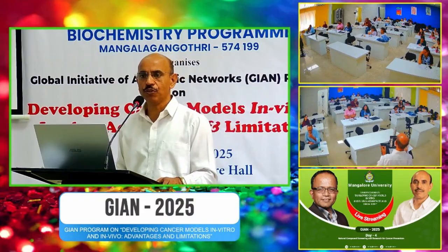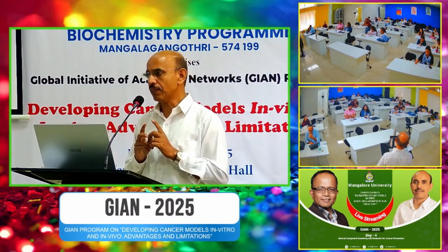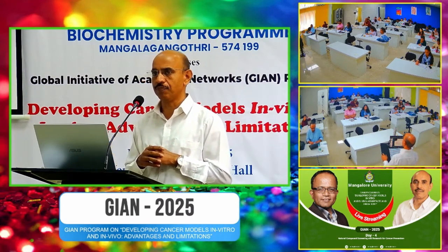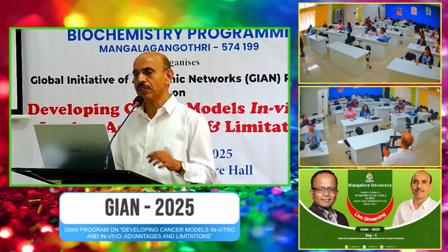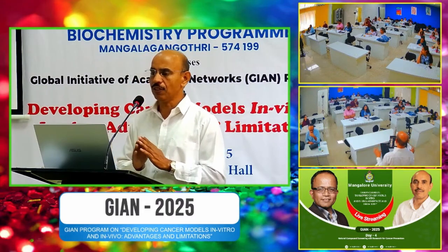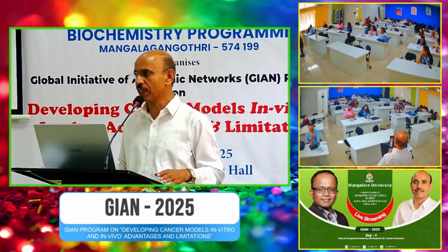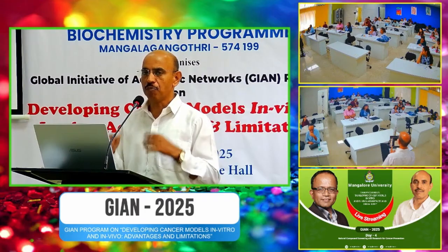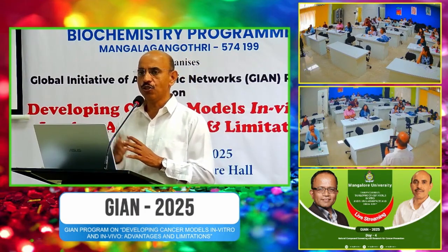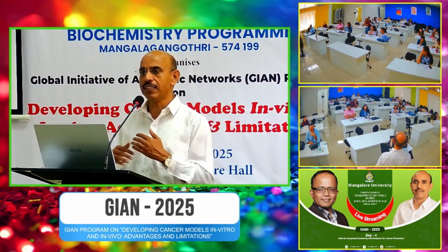you do UV sterilization of that area, because that is the best way you can avoid most of the contaminations. Even the biosafety cabinets come with UV sterilization. The best way is that you swab the biosafety cabinet before work and after the work. Before work you switch on the UV maybe for 15 to 20 minutes, and switch on the UV after the work also for 15 to 20 minutes. So that is a good way you can avoid most of the contaminations.